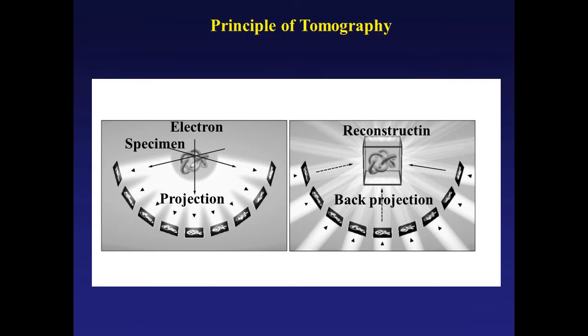And as the specimen of a transmission microscope is very thin and the image is a 2D projection, it is a kind of disadvantage of the transmission microscope because depth information cannot be observed. Then recently, the electron tomography technique was developed. The principle is the same as X-ray tomography: observing the specimen from different directions. That means the goniometer of the transmission microscope can be controlled. We can observe many projected images from many directions. After that, with mathematical support, we can reconstruct the three-dimensional information.